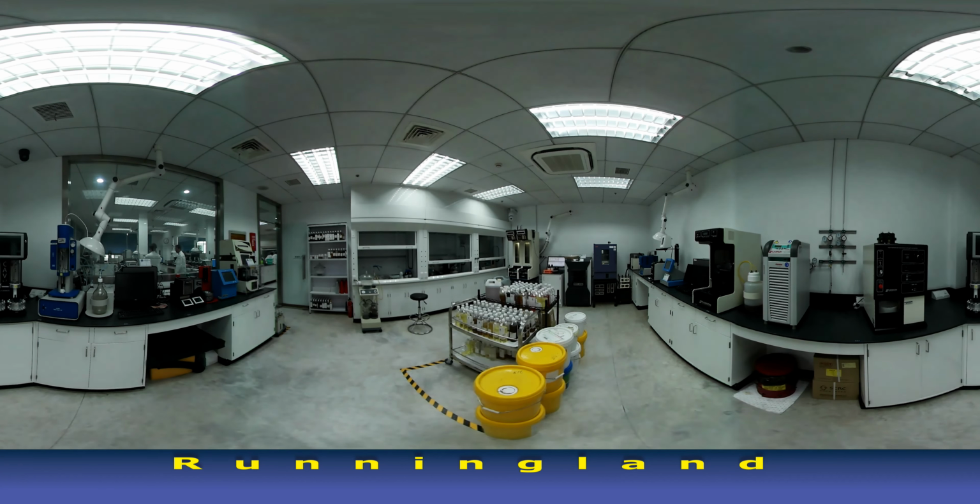This lab also contains other testing instruments from AD Systems, Phalex, and Cannon Instruments, but please feel free to look around and I'll show you the rest of the lab.